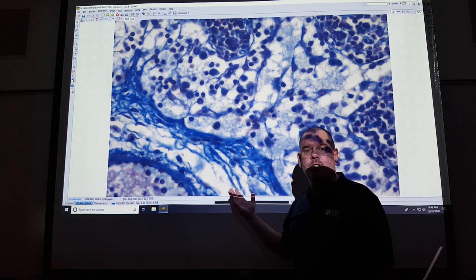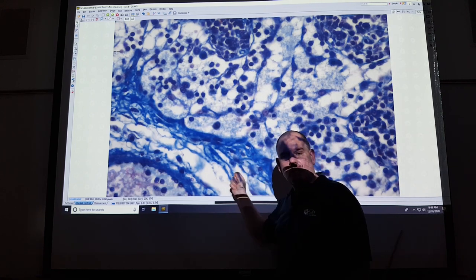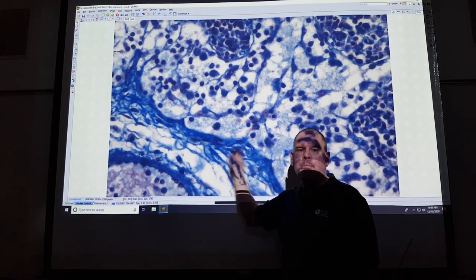You'll talk about that in your lecture. Remember, for lab, it's just the appearance of the stuff. What does it look like? Name it, name the type, one location.